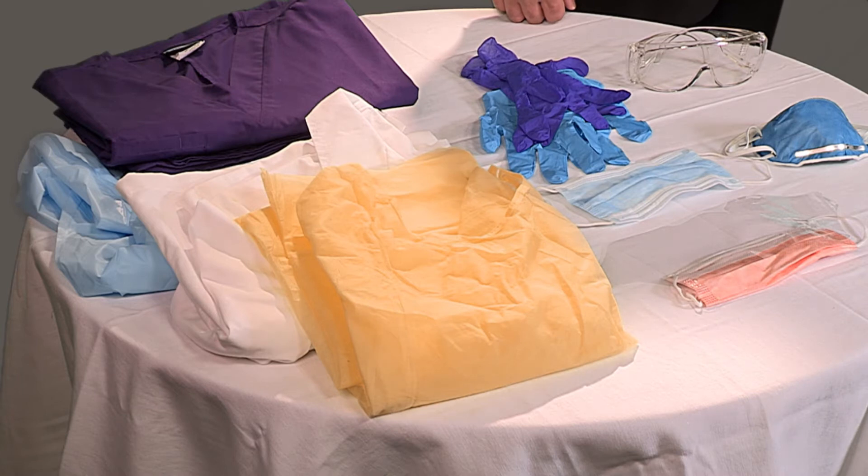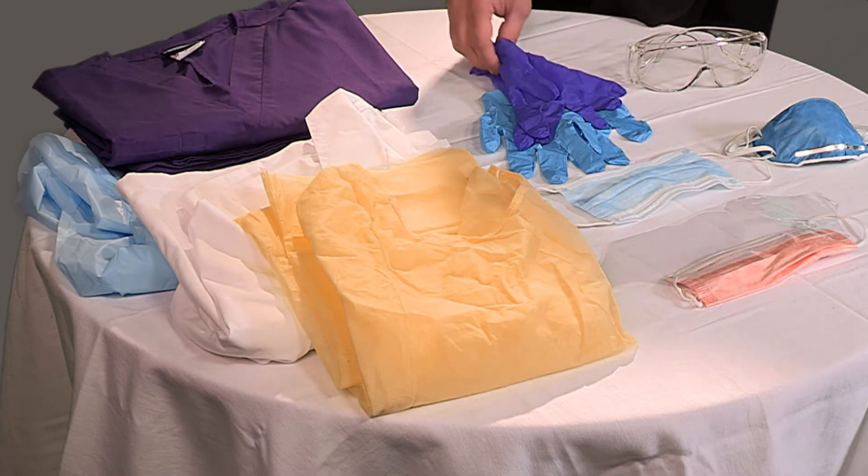Appropriate PPE could include eye protection, face shields, and the proper gloves for the task at hand.